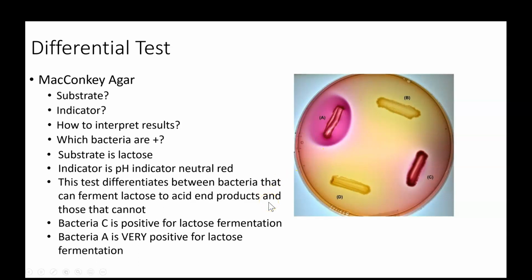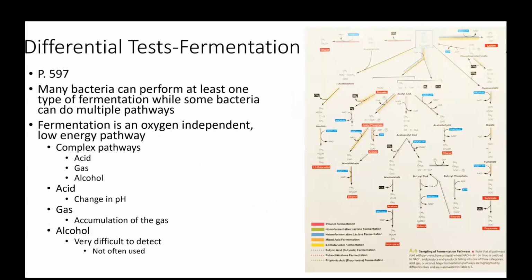So you've already done your first differential test in the MacConkey agar, but let's look at the differential tests in a little bit more detail before we dive into the 3 that we are doing today. So remember this beautiful picture, this graph on page 597 that looks terribly complicated, but let's again just boil this flow chart down to its important components.